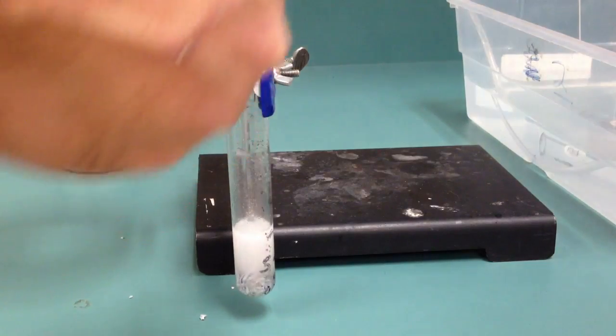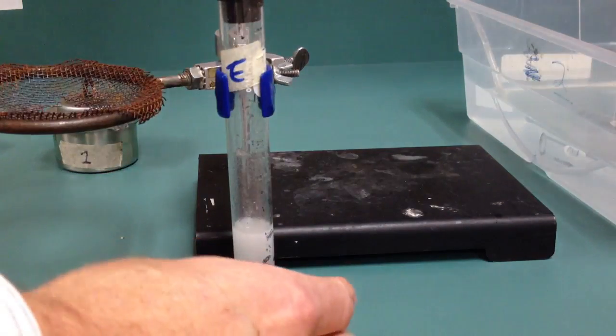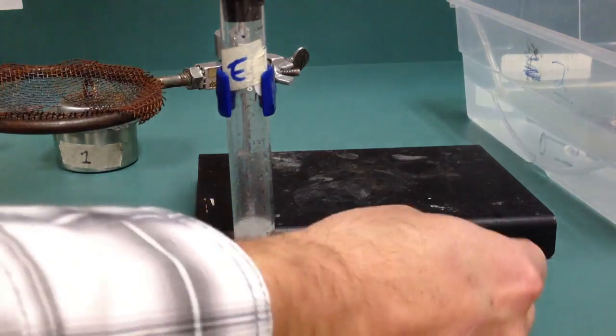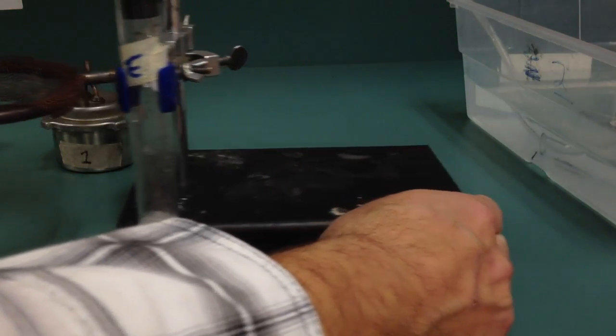We're going to send the hydrogen gas through this tube. So, while this reaction is going on, by the way, this is going to get nice and warm down here, because it's what's called an exothermic reaction, or it's giving off heat.